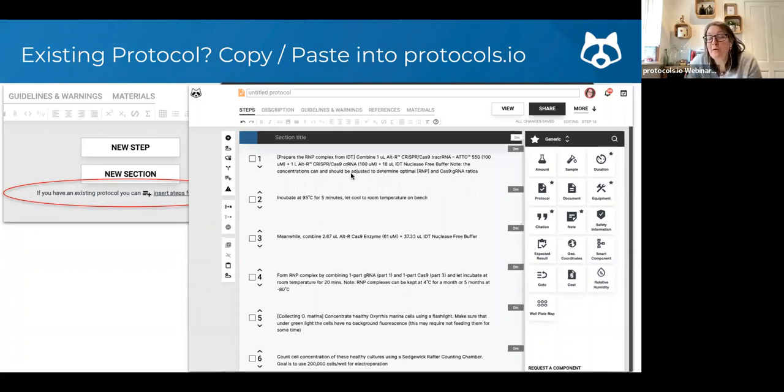And if you wanted to, because that doesn't give you any of the actual components, if you selected the 5 minutes and then duration, the component on the right hand side, you can format these to take then advantage of the components that we have. 95 degrees C, you can grab the temperature one and format that accordingly, and so on.